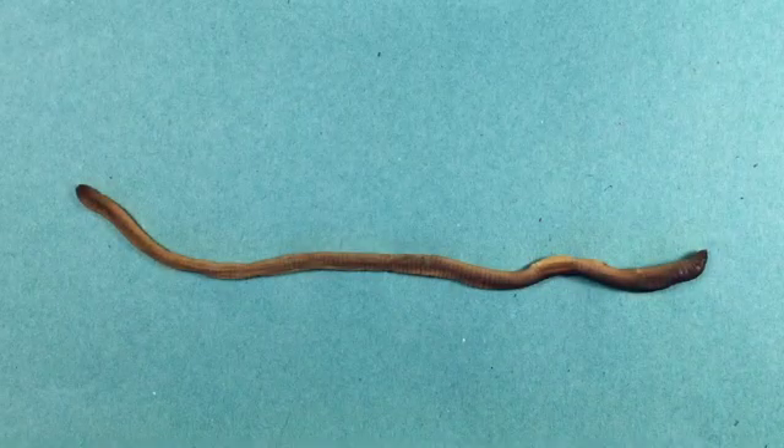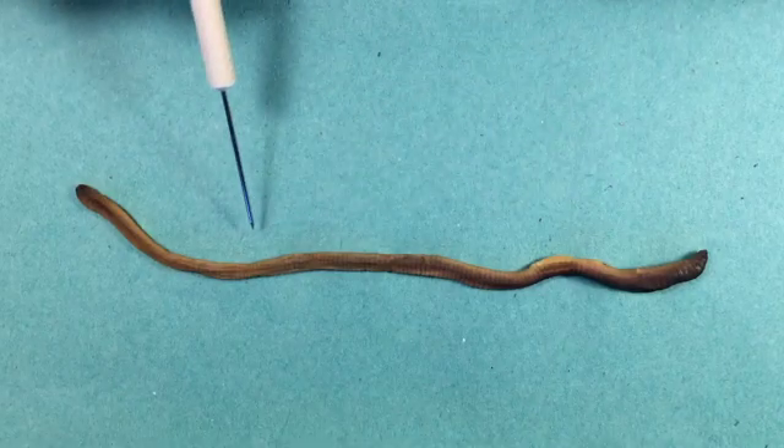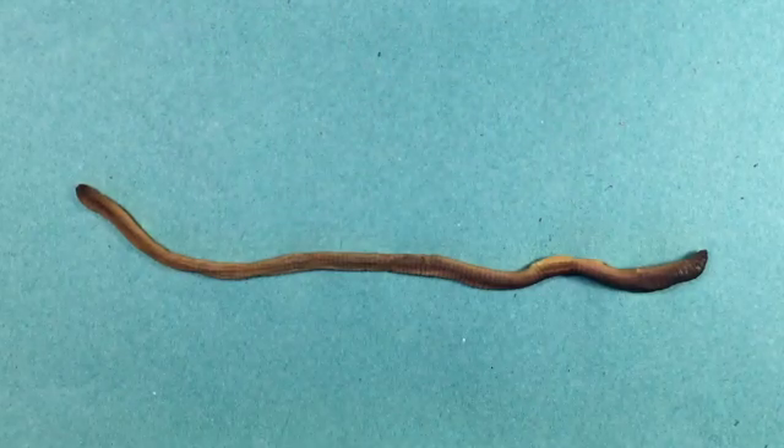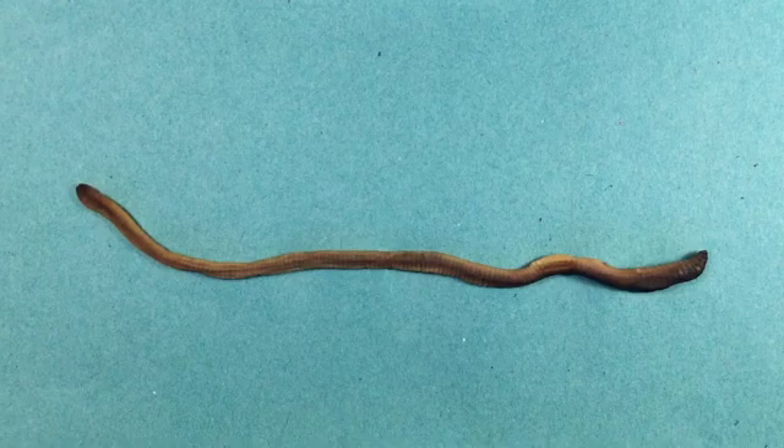This video shows one way you can dissect an earthworm so that we can see its internal anatomy. I'm also going to highlight some of the interesting features that we might see along the way. The earthworm I have in front of me is the common earthworm, Lumbricus terrestris. This specimen is preserved, which makes dissection a lot easier and a lot less messy.